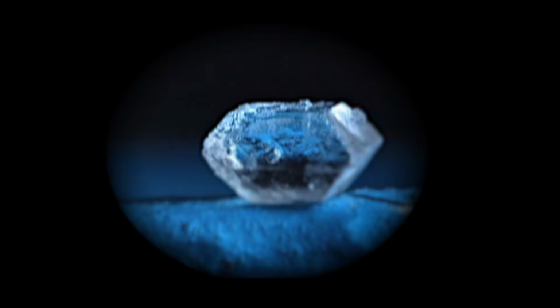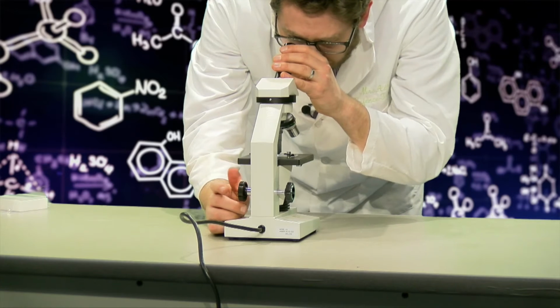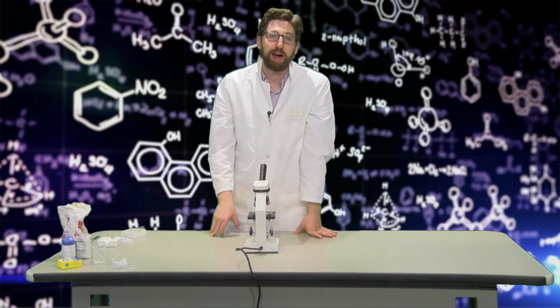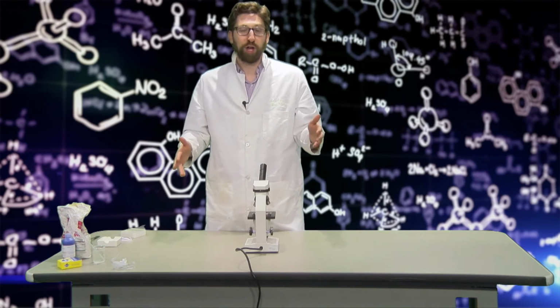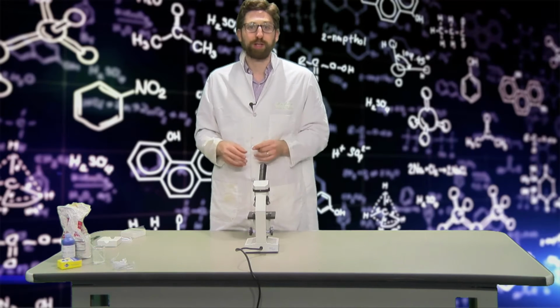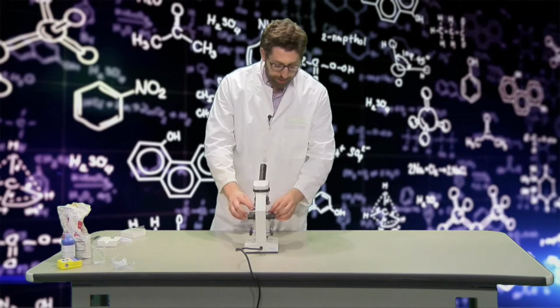I use my focus knob, and I'm actually zoomed in so far that I'm just looking at one corner of one sugar crystal. This microscope is letting me see things I could never see with just my eyes, and that's what's so special about microscopes. That's what let us use microscopes hundreds of years ago to discover unicellular organisms, living things so small they're only made of one cell. Speaking of cells, I'm going to try to make one more microscope slide.